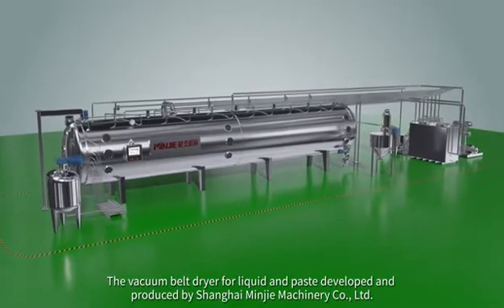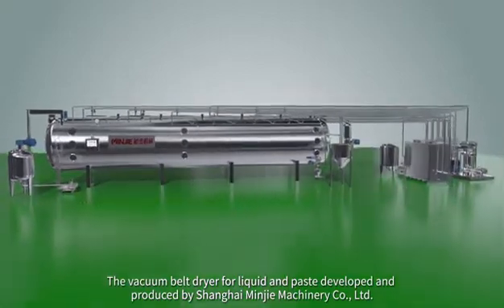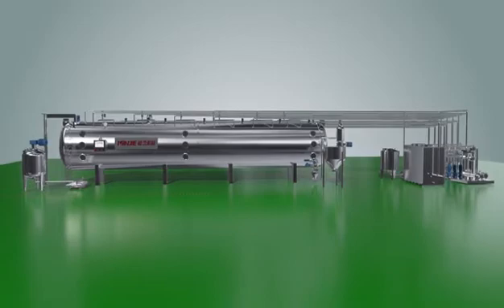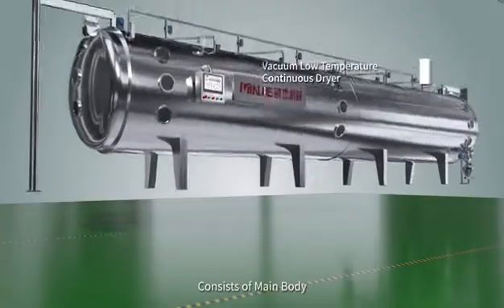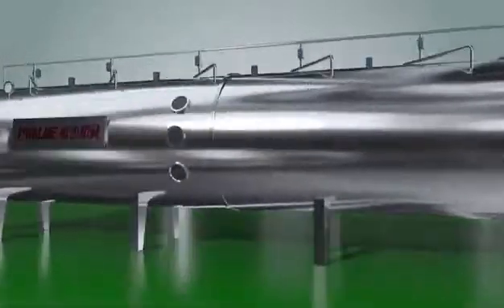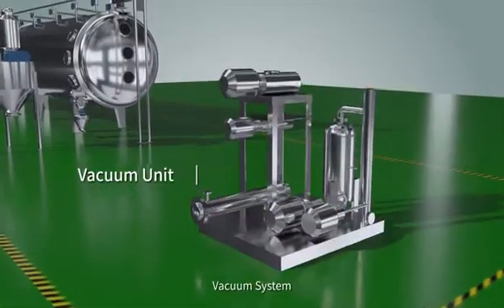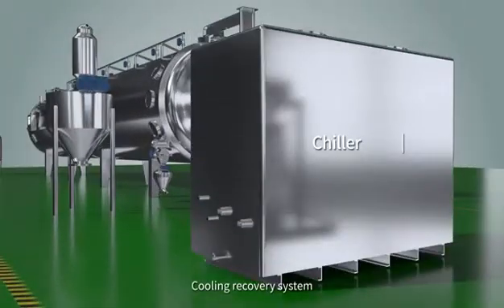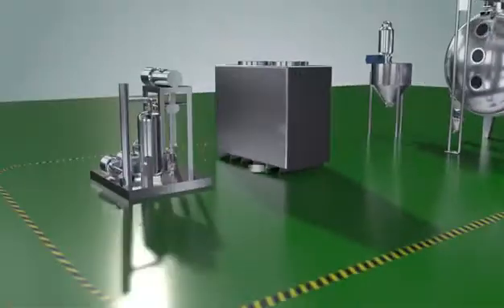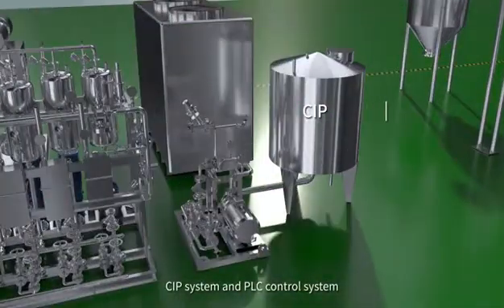The vacuum belt dryer for liquid and paste, developed and produced by Shanghai Minjie Machinery Co., Ltd., consists of main body, feed system, discharge system, vacuum system, cooling recovery system, heating system, CIP system, and PLC control system.